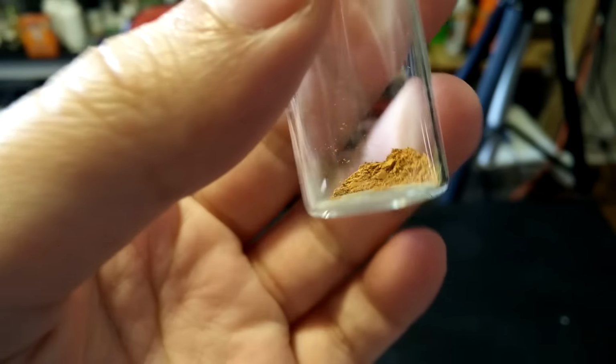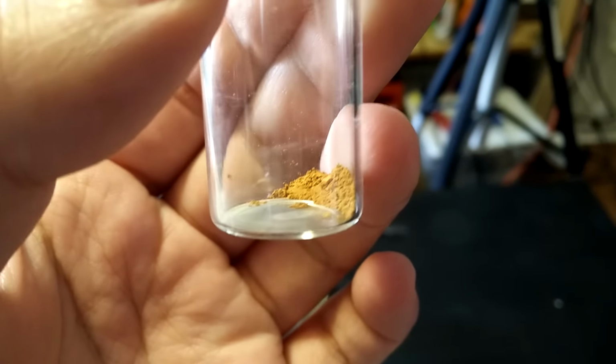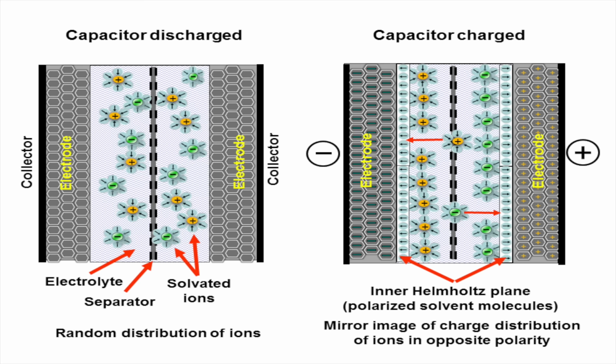So what's the point of making this copper oxide? Well, as you can see, it's quite colorful, and it's been used as a pigment and as an anti-fouling additive to paints that'll be used in aquatic environments. It's also a fungicide. In terms of electrical applications, the first diodes were based on copper oxide, as it's a very good p-type semiconductor. I'll be using it in everything from electrochemical devices to solar cells.